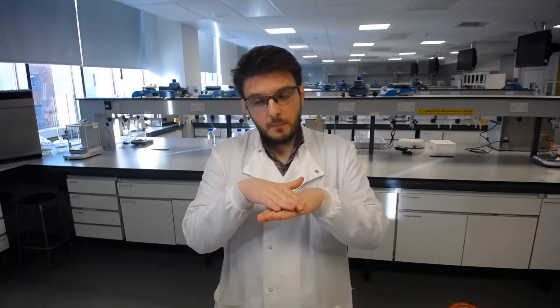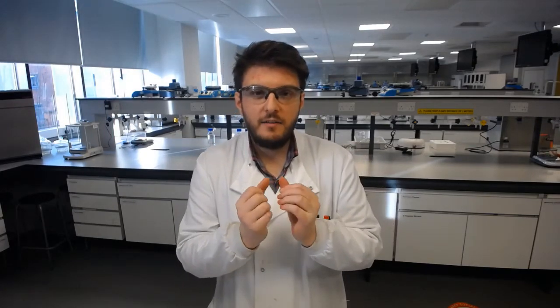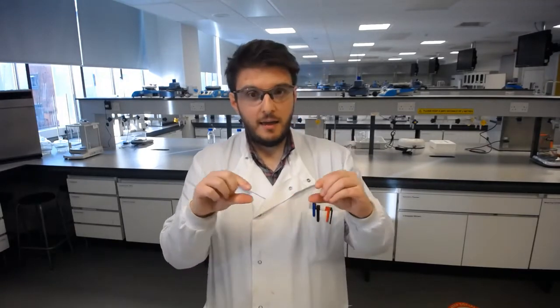And if we've got a really, really fine particle size and they sediment very, very slowly, when they deposit on each other, there's not going to be an awful lot of water between the drug particles. And they'll pack very densely at the bottom and they'll form a cake of our drug particles.